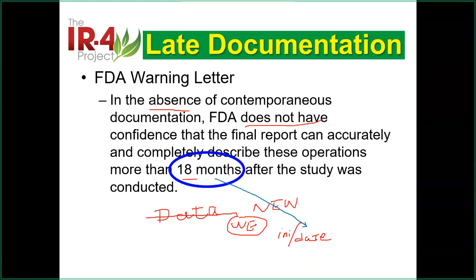Oh yeah, I weighed 10 grams. Oh, it's not 10 grams, it's 10.05. Of course, you read it that way, you change it immediately. It wouldn't be like 3 months later. Yeah, my recovery is 121. If I make this a little bit higher, then my recovery is 119, then everything's good. Then that's wrong. So the intention is wrong. This is something you intentionally try to cheat, so it's no good. And people can find that easily. This is not difficult to find.